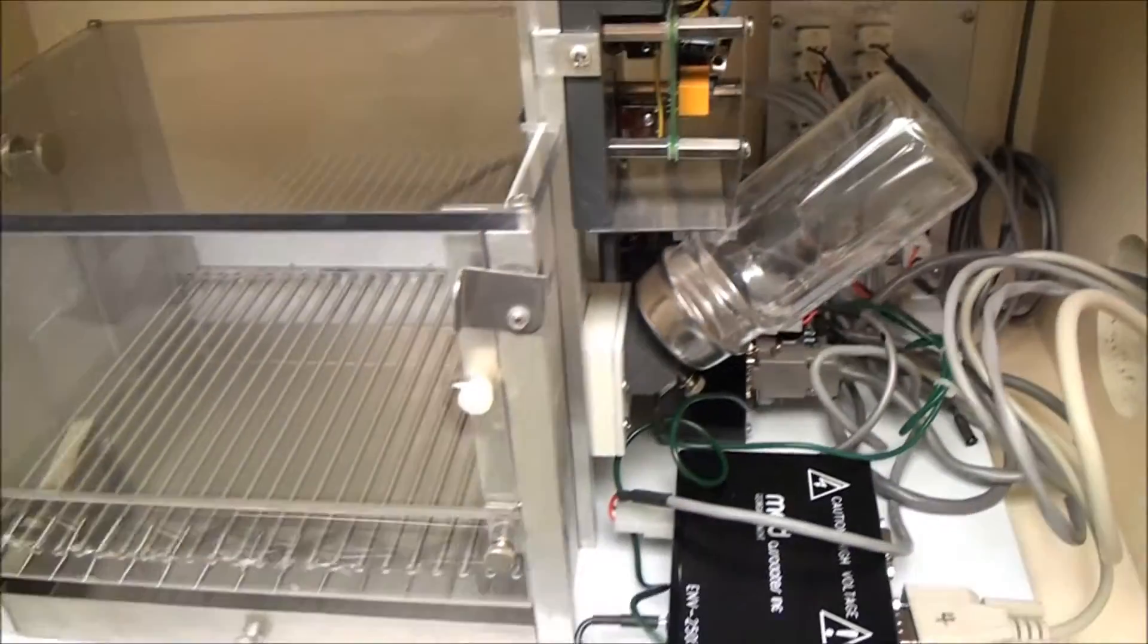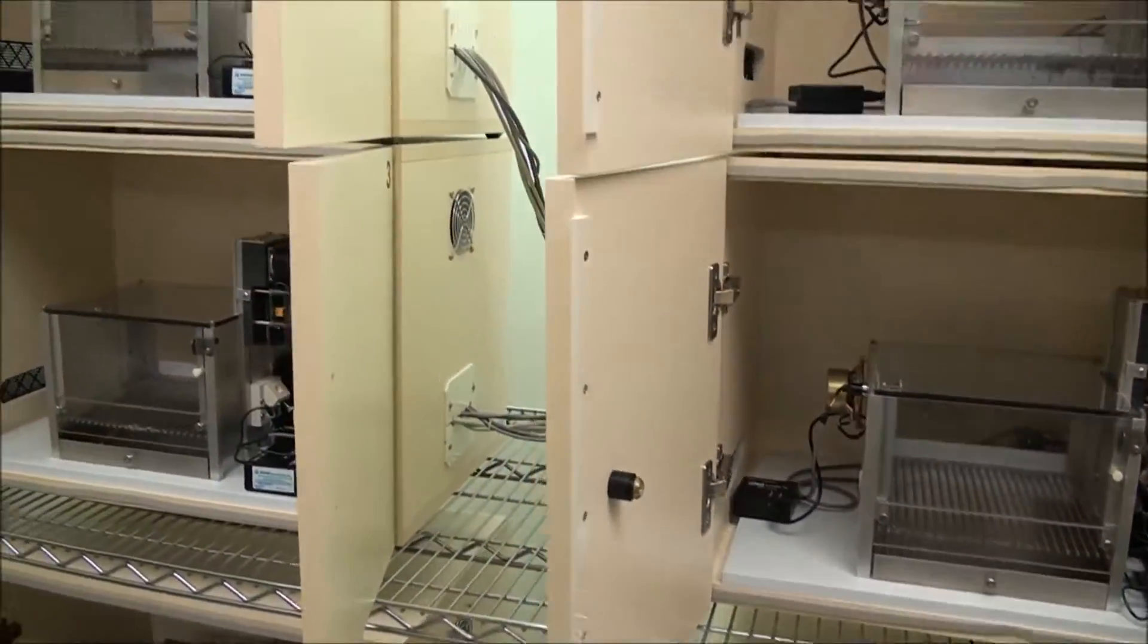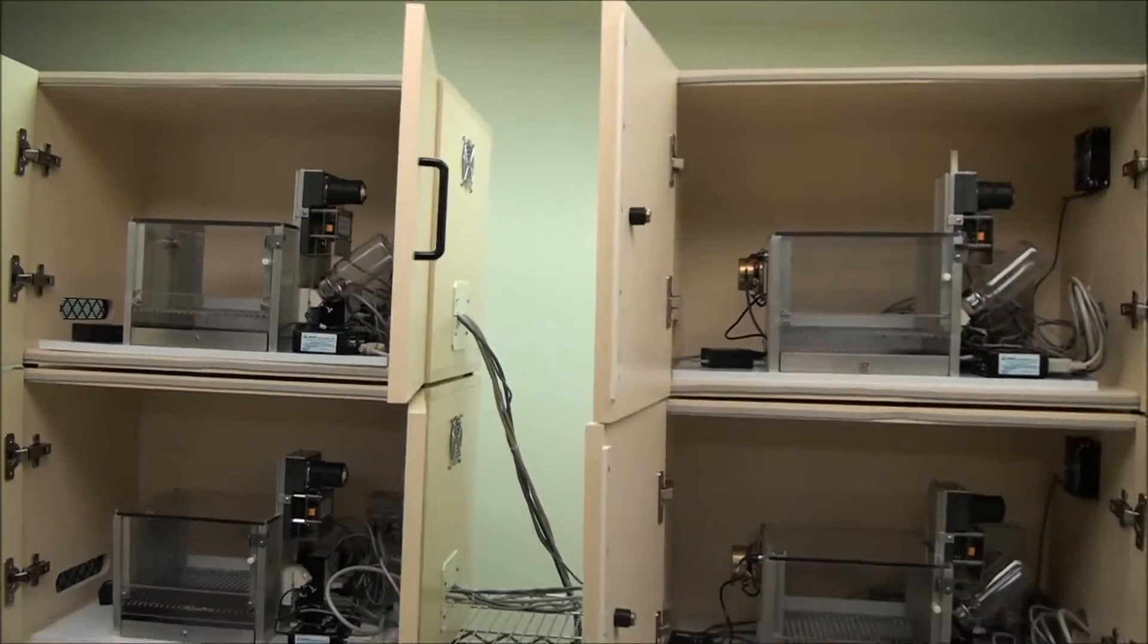There is a lot of wiring. You will need to know a little bit of programming on this software to do your tests. But definitely a really nice system.